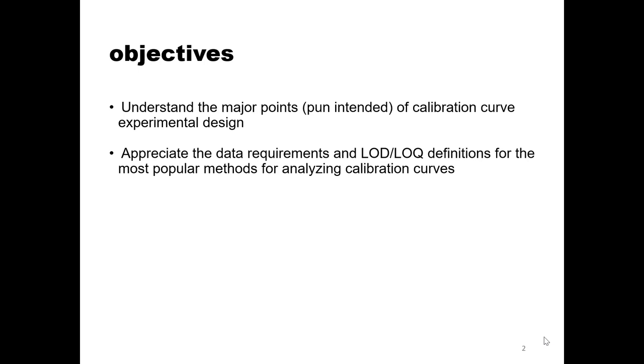The two main objectives, again, I'm going to give you a lot of detail, but as long as you take away these two points, then you have accomplished your goals for this lecture. One is to understand the major points, pun totally intended, of calibration curve experimental design, and the second is to gain an appreciation of some of the data requirements.